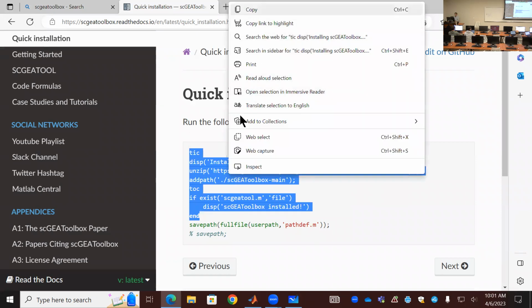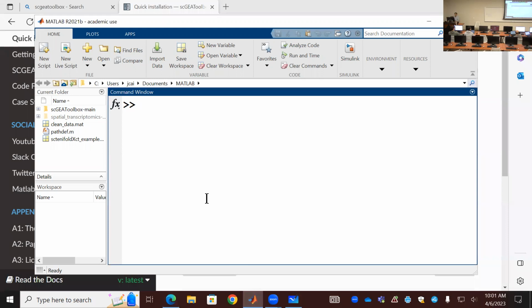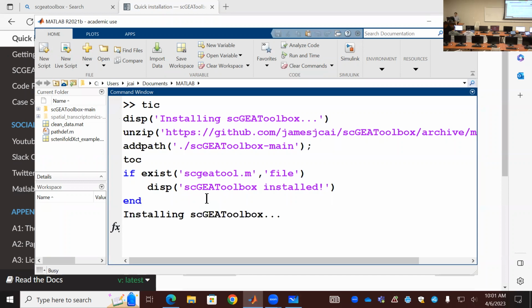You know where to go and copy this code, and come back to the same folder and just overwrite the current folder. There's some behavior change for some of the steps, so you want to have the updated version so we're on the same page. Otherwise, what I demonstrated here will be different from the older version you use on your computer.